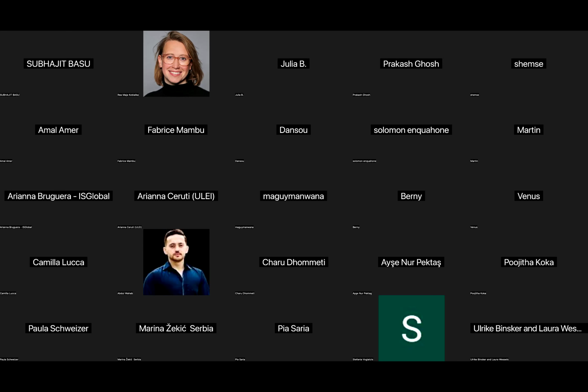I think again the question is, what do you really would like to do with this sequence? Let us say with the long reads. I think if you go for metagenome-assembled genomes, MAGs, the work is very limited, it requires a high-end facility. You cannot go for MAGs in remote settings, and that is not the objective. I think the purpose of nanopore sequencing is to serve the democratization of sequencing.